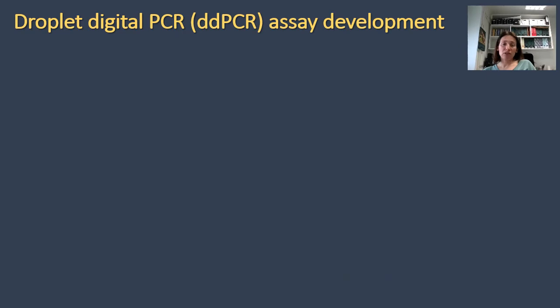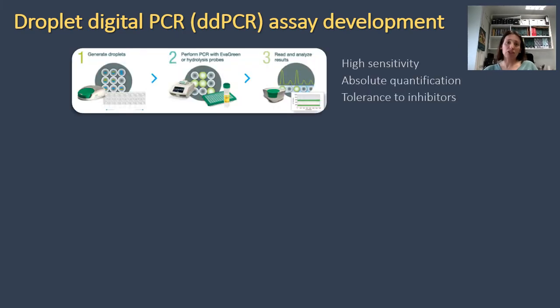And we have used sensitive technology, digital droplet PCR technology, which also allows absolute quantification of target sequence, and it is quite tolerant to inhibitors in comparison to standard quantitative PCR.